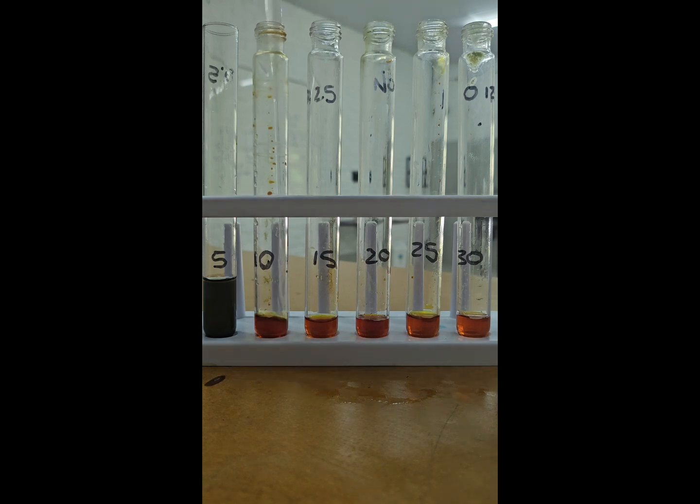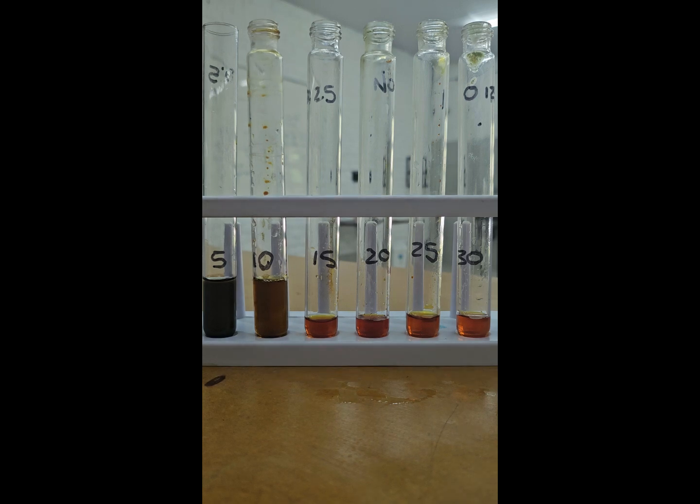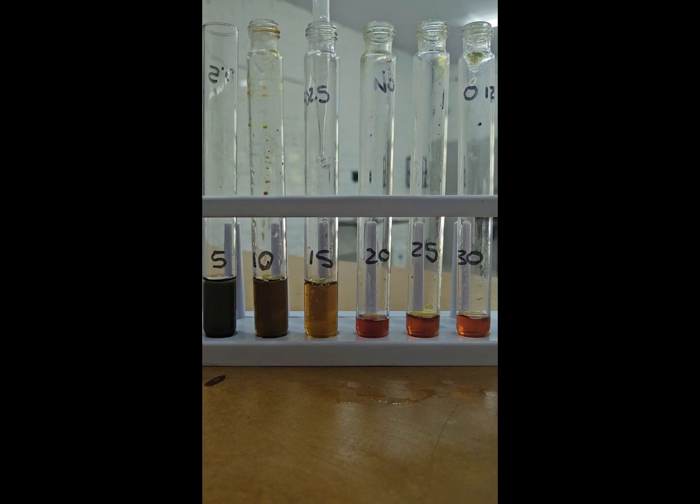I can then add it to 10 minutes after 10 minutes has passed, and here I can see that the color change is slightly less, but it's still a dark color, meaning that there is still some starch present. After 15 minutes, I can add my starch solution again, and here I can see that the color change is very slight, meaning that the amount of starch present is minimal.